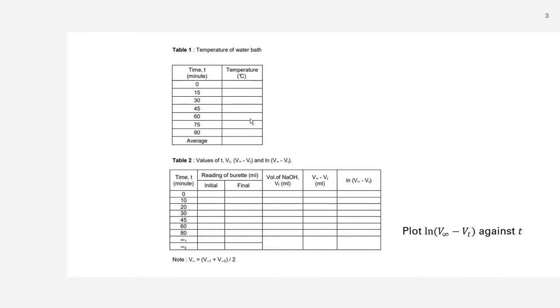You have a thermometer that you immerse in the bath, although there is a digital thermometer on the thermal regulator, this one is more accurate. You just want to make sure that it's constant, and most of the time it is. We just want to make sure, because if it's not constant, your results are not going to be consistent.